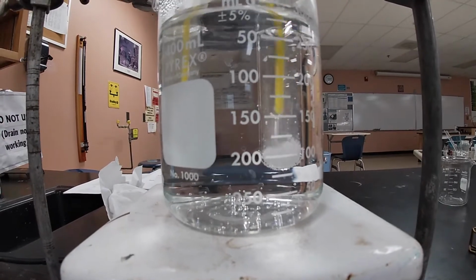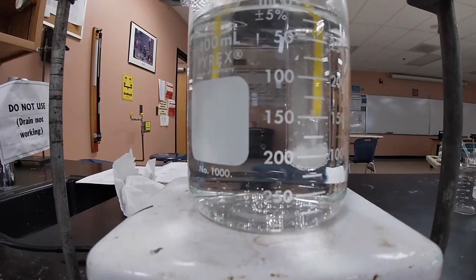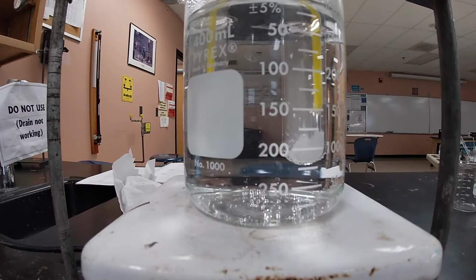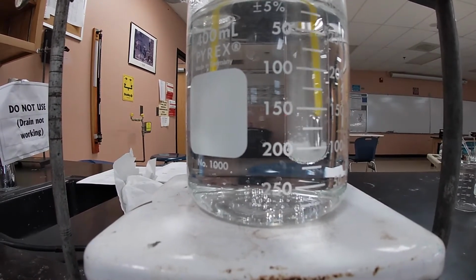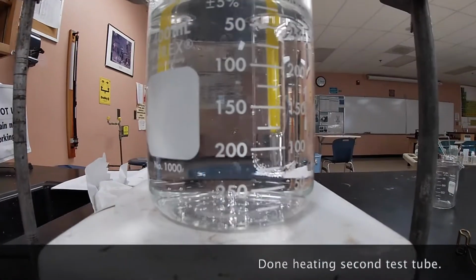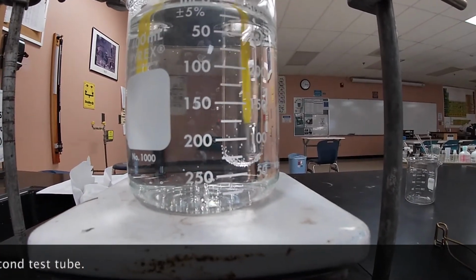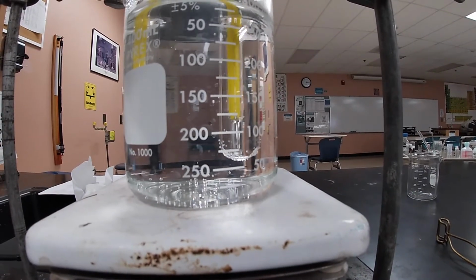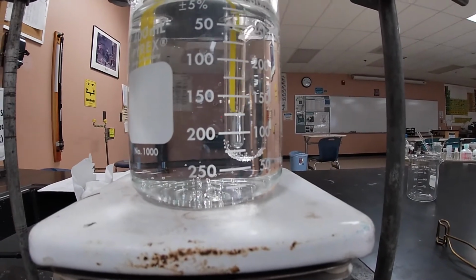And like I said, once we're done dissolving the salt, then we'll go ahead and remove it from the heat immediately, and then allow it to crystallize, and then we'll calculate that temperature. Okay. All right. As you can see now, our test tube that contained 4 grams of potassium nitrate in 5 milliliters of water has dissolved, right?